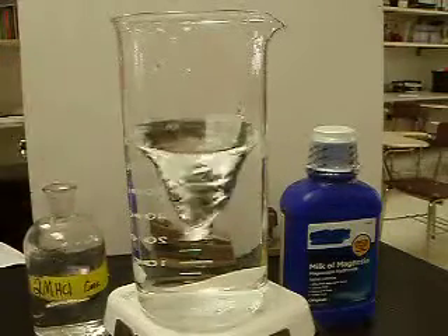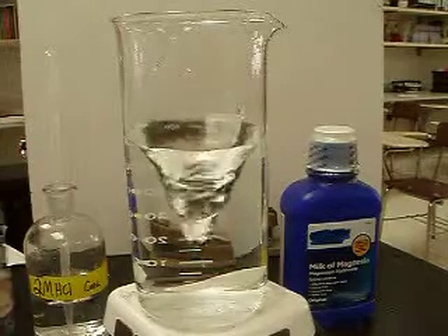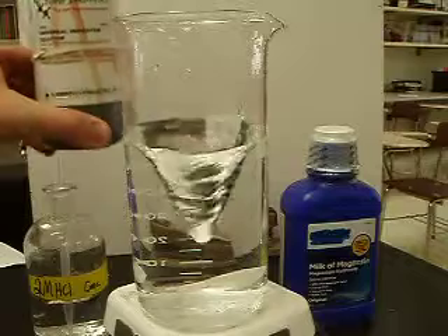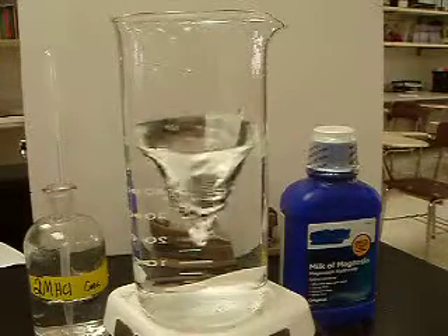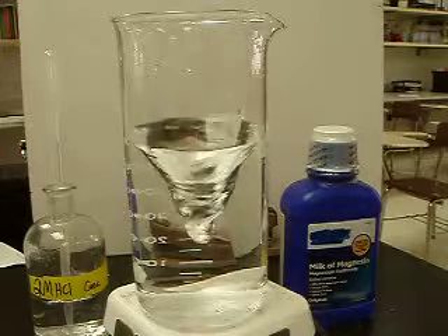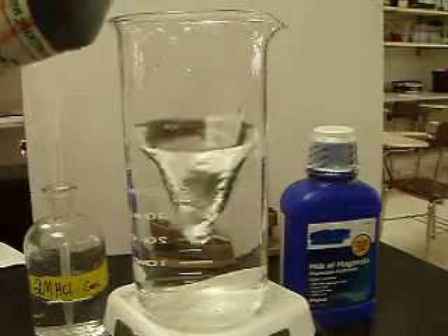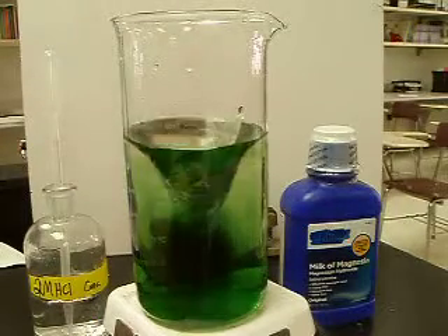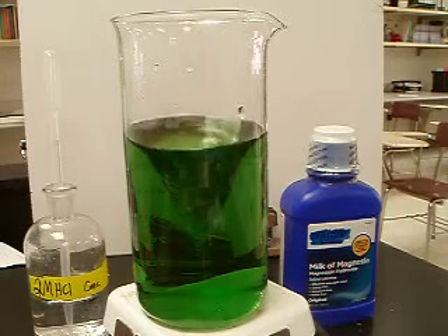We've got some two molar hydrochloric acid, we've got some magnesium, and we've also got what's known as universal indicator. I'm going to edit in an image of what universal indicator looks like at different pHs. Basically, universal indicator is a combination of three different chemical indicators that change color based on pH.